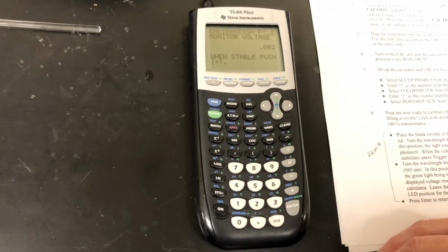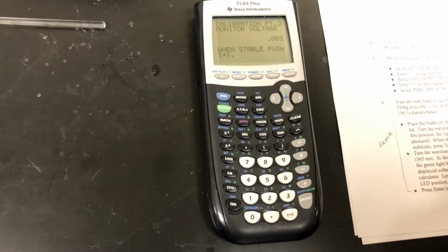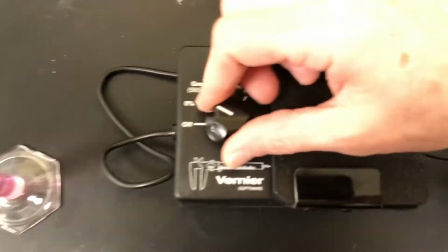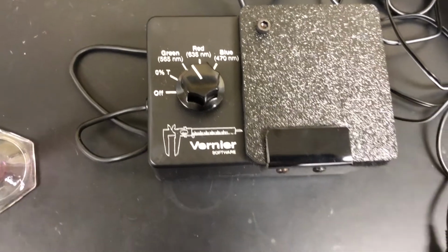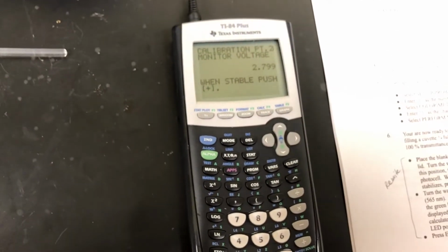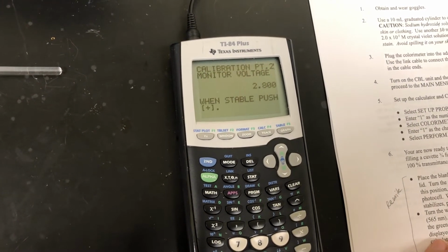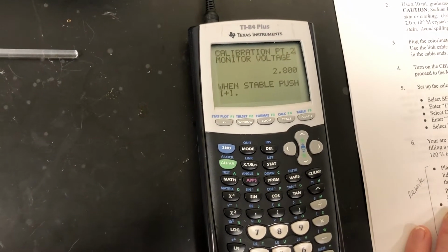and that will give it the first data point. Now we need the 100% transmittance value, so essentially the range, and for that we need to change our setting from the 0% up until green, which is the wavelength that we're going to be using for the crystal violet, because it's a complementary color to purple, and while the solution is purple, it will absorb the most amount compared to other wavelengths.